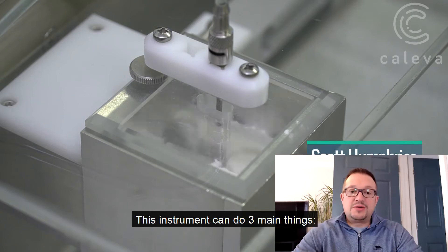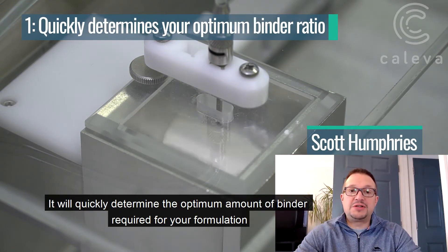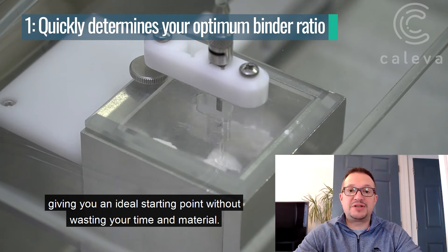This instrument can do three main things. It will quickly determine the optimum amount of binder required for your formulation, removing most of the trial and error work, giving you an ideal starting point without wasting your time and material.